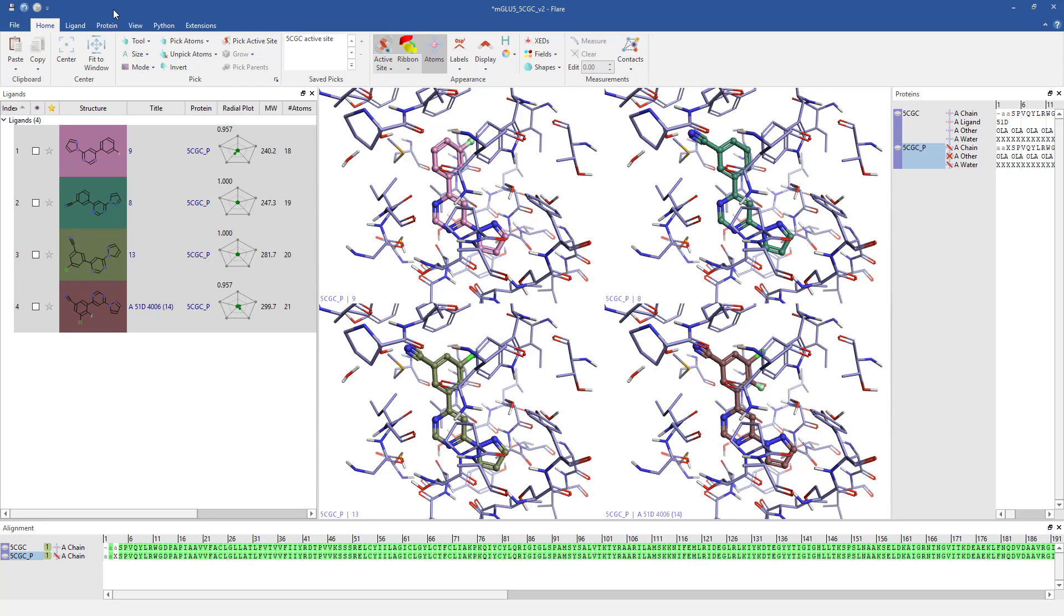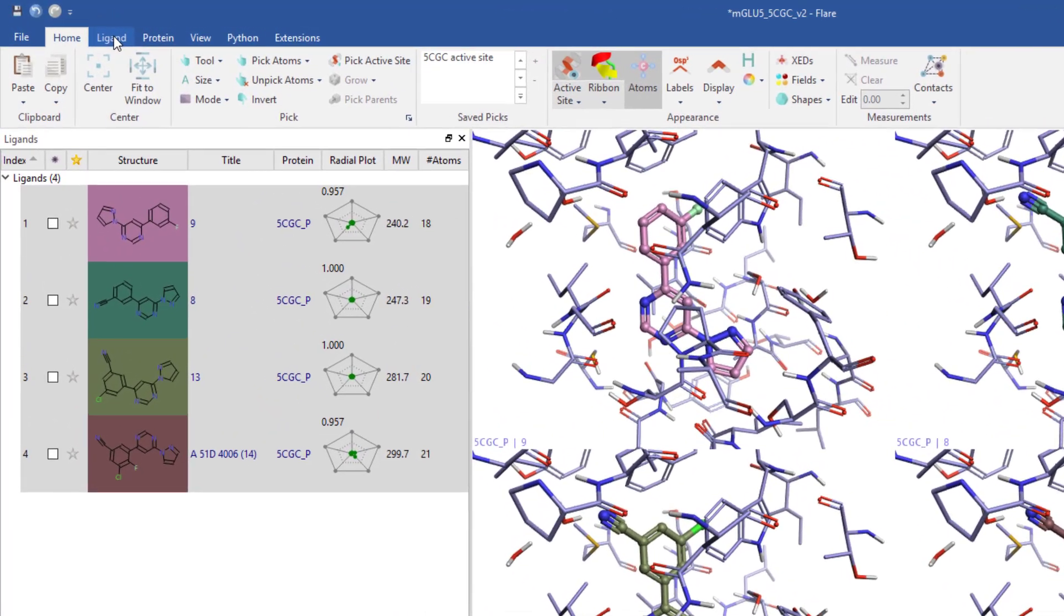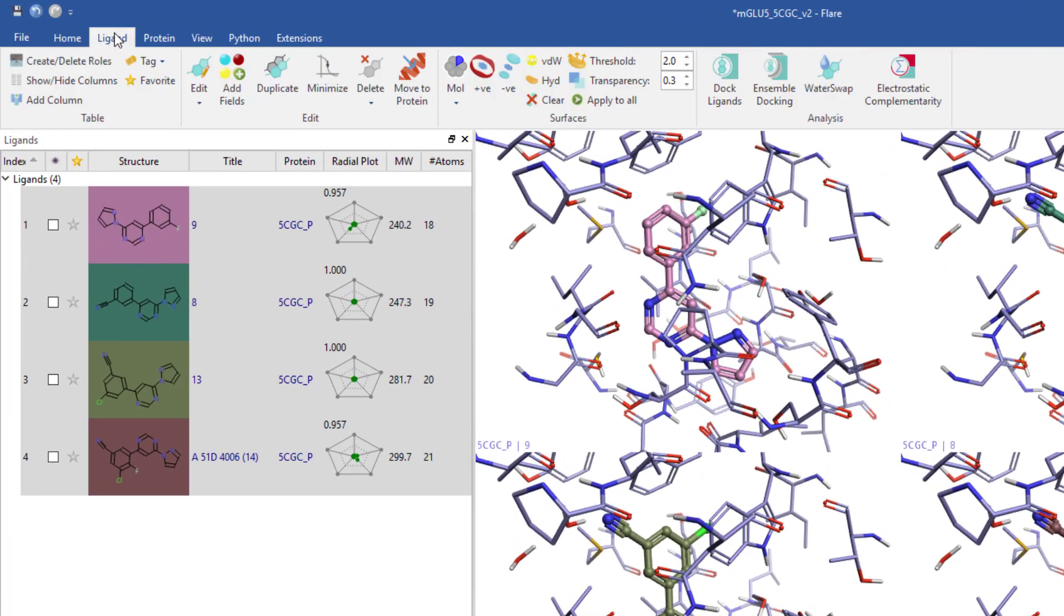Select desired ligands, go to the ligand tab, and hit the electrostatic complementarity button.